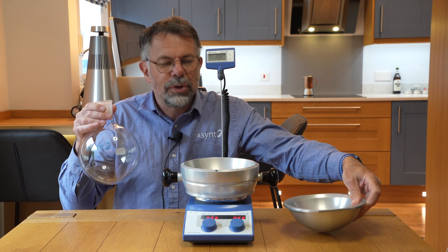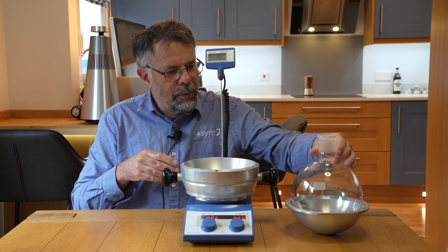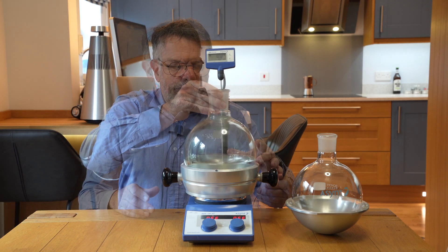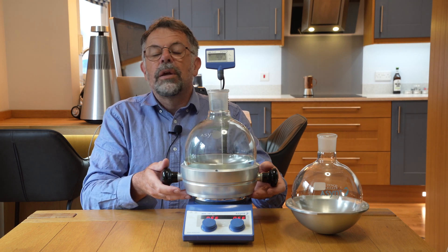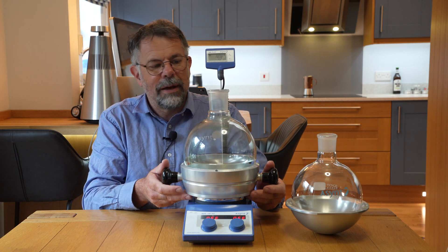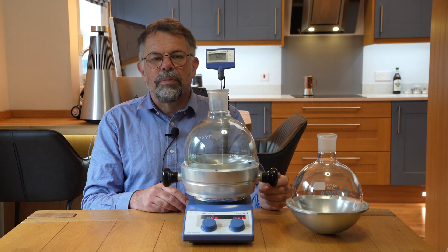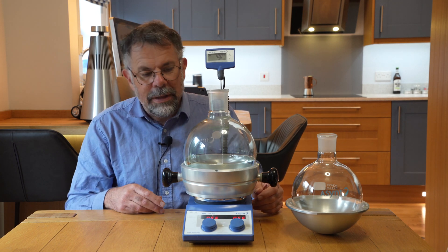We have an insert, just as you may have seen in our Drysyn Classic, which then allows the base to take a 3 litre vessel, which I have one prepared here. Very much the same design as other Drysyn units, with the ability to adapt the base to fit any hot plate stirrer you have. A temperature probe pocket for you to mount a high accuracy temperature probe you may have with your hot plate stirrer, and good strong magnetic stirring.